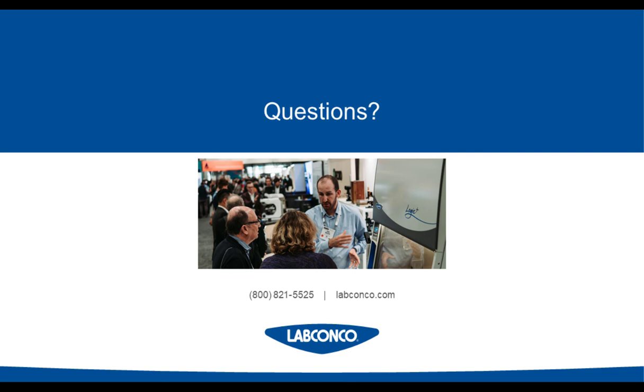Thank you again, David. I just want to remind audience members that any questions not answered today will be answered via email. We have time for a couple more questions, David. Is there a Magnehelic gauge reading that will indicate that the BSC is out of specification? For example, 10% of the certified reading.